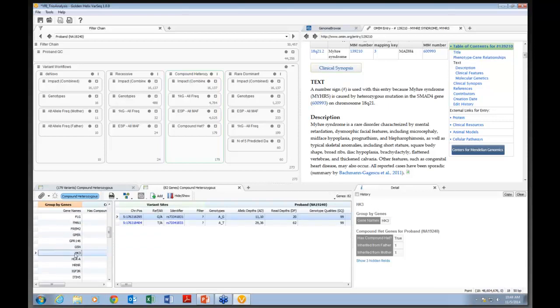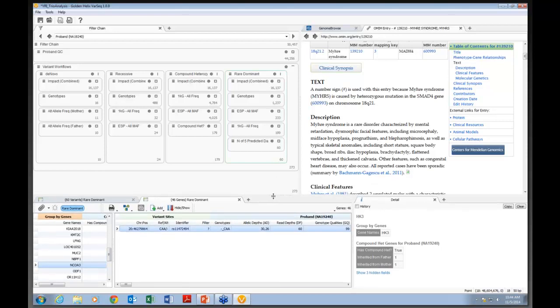So if we wanted to look at HK3, for example, we can scroll through and see exactly what's there. And let's move over just a little bit. We can see that in 1000 Genomes Project, one of these is previously unknown, one is very rare and only ever observed in Africans, and so on. And finally, then, we have the rare dominant workflow that's picking out 60 variants. So the process here is similar to what we saw with the gene panels.